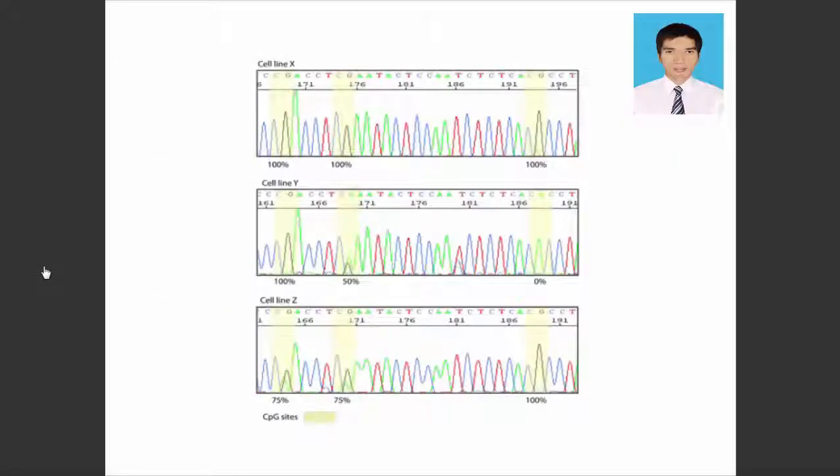The resulting PCR fragments from amplification of bisulfite-treated samples can be visualized by agarose gel electrophoresis and sequenced directly. Shown here is a sequence trace from three different cell lines with CpG sites highlighted in yellow.